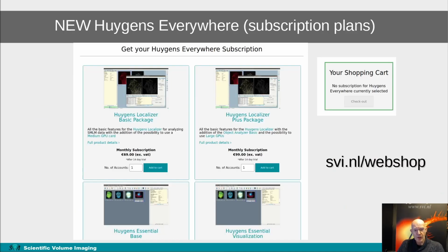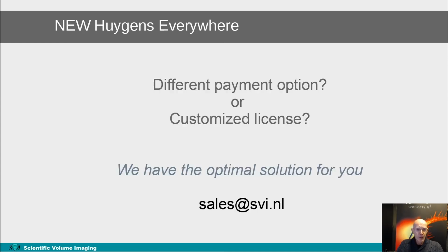New Huygens customers can visit our website svi.nl, look for the web shop, and there they can get their own subscription with a monthly and yearly payment. If you prefer a different payment option or you like to have a more customized license, we find with you the optimal solution. So just contact us at sales@svi.nl.